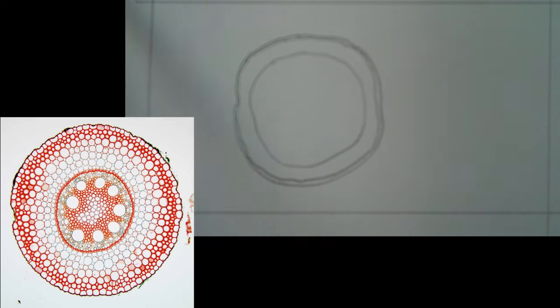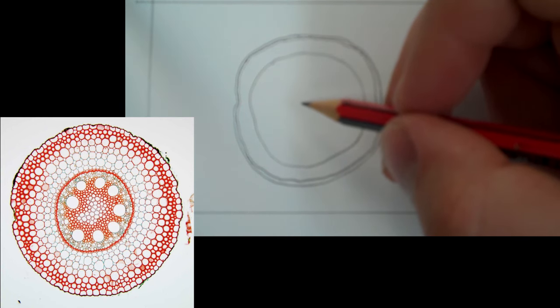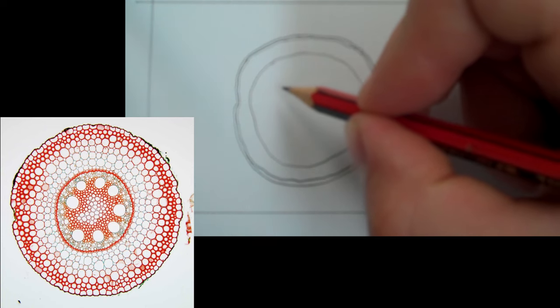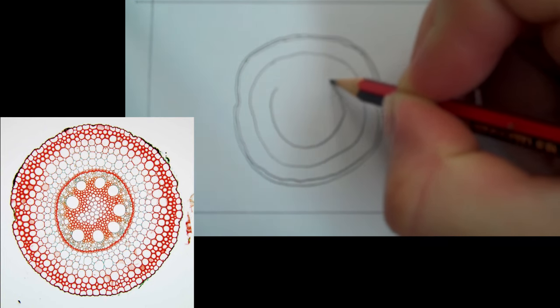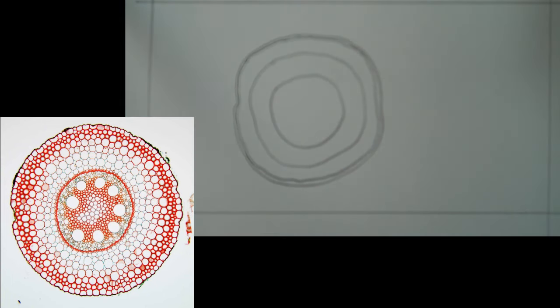Okay, fantastic. Alright, and then we've got our innermost circle. We can see a dark red line there separating that. That looks like it's one side of the cells there, or possibly one small layer of cells. So let's draw that one in. Okay, fantastic. Arguably we should make that a double layer, but it's very thin, and my diagram here is quite small to fit on the camera, so I think I might actually just leave that one.